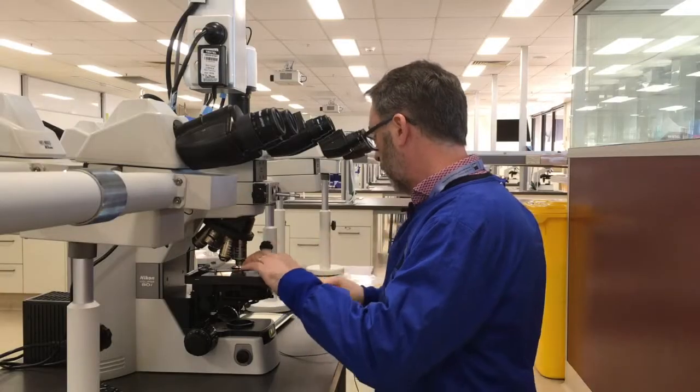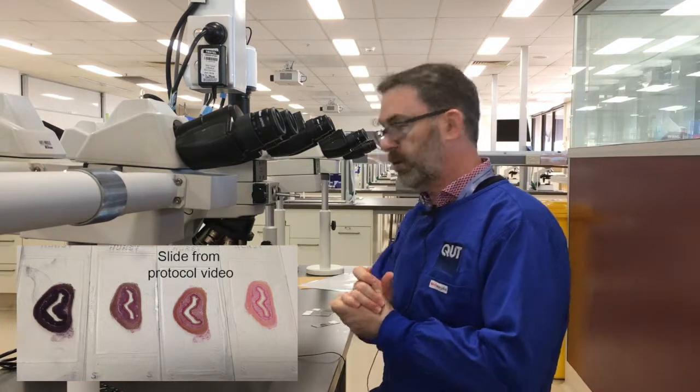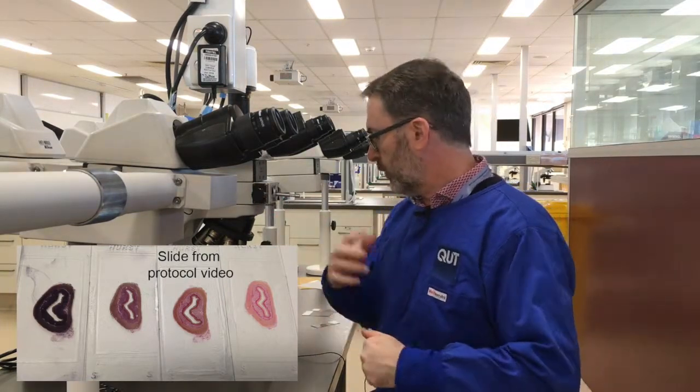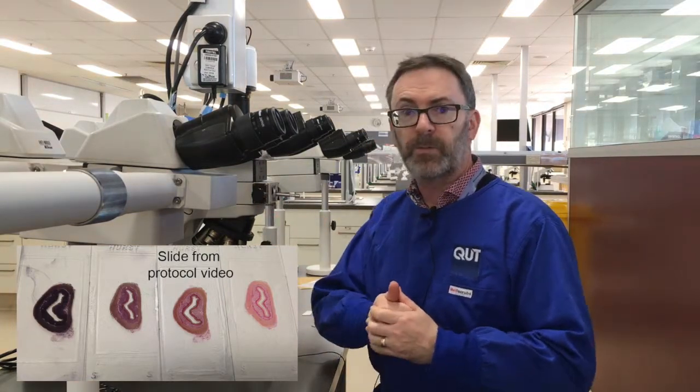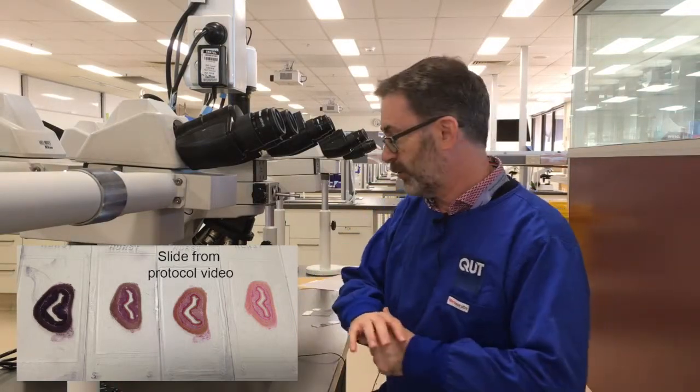I've gone through a class set and found basically a spectrum of results in terms of the amount of hematoxylin staining on the slide. I'll throw in a picture where you can see all the slides together.